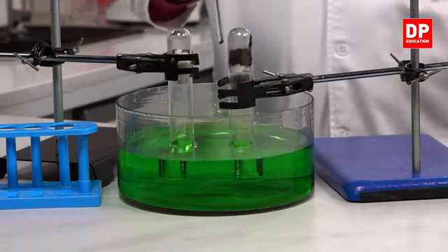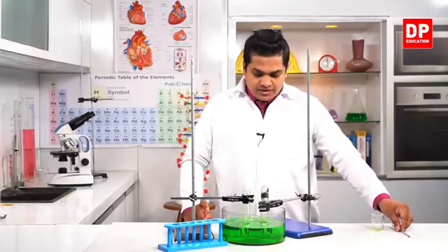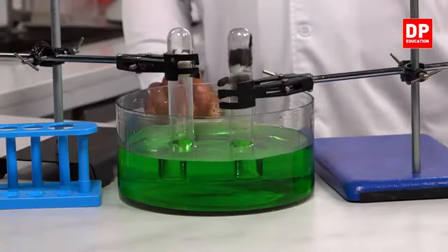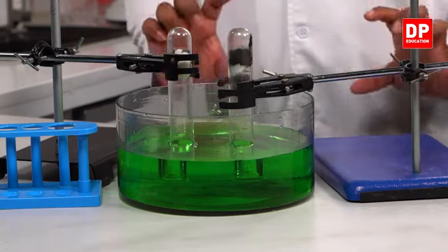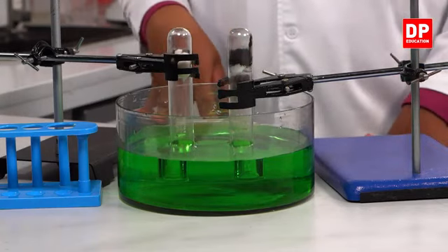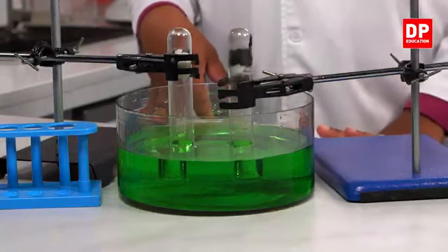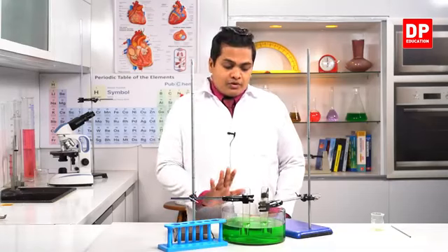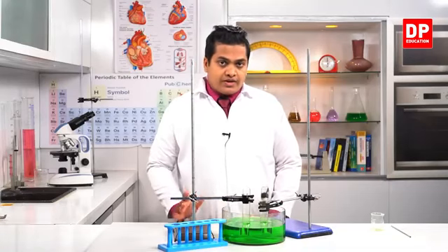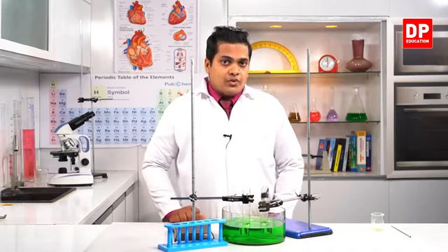Right. Now after the rusting process starts, you can observe the clear level of the water after rust has been created on the iron filings. So right now I'm going to keep this system for about 2 to 3 days. Then after that, I'm going to observe what happens.